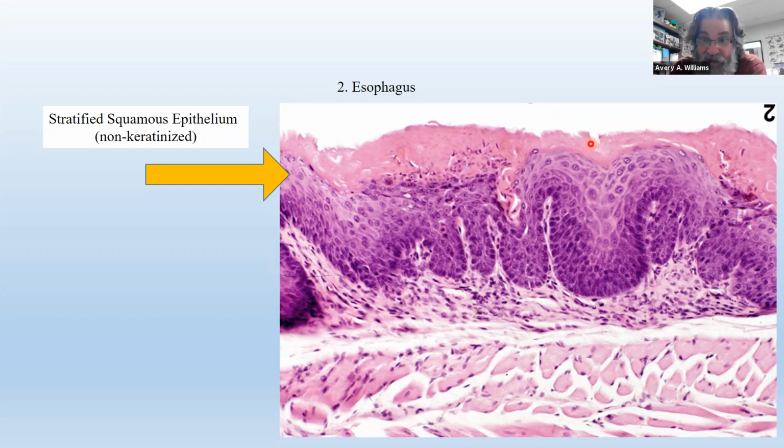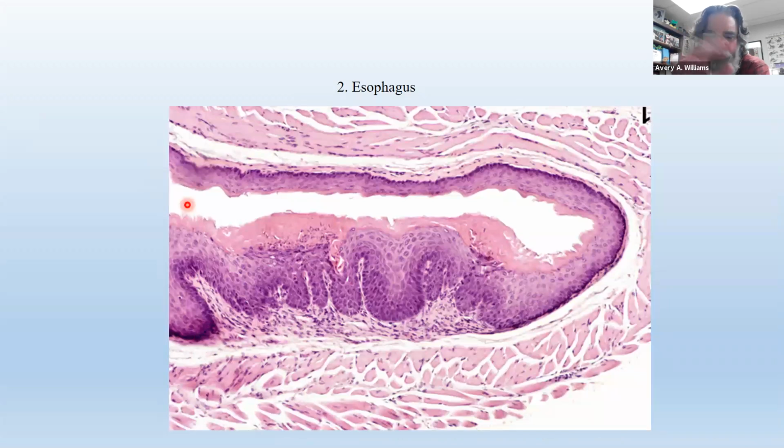And you can tell that because you look underneath the microscope. This is the dead layer of cells. These are the living layer cells. You can see nuclei and all that. But up here, you can't see the nuclei and everything. But it's not dry and flaky. It's just kind of nothing going on in the cells. It's kind of forming this boundary. But the whole thing from here all the way to here is stratified squamous epithelium that's non-keratinized. From here to here is dead. From here to here is living. See how that works? All right, zoom back out so you look at the whole thing.